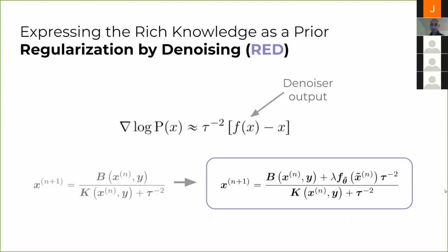Now, how do we plug this in? The specifics of how to plug this into the reconstruction come along with this framework that I mentioned briefly, which is called RED, or regularization by denoising. We had to make a lot of innovation regarding how this should be specifically applied to cryo-EM to make it work. So we say that it is inspired by regularization by denoising, but it's quite similar in a sense.